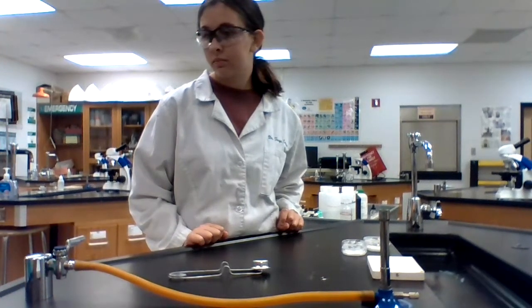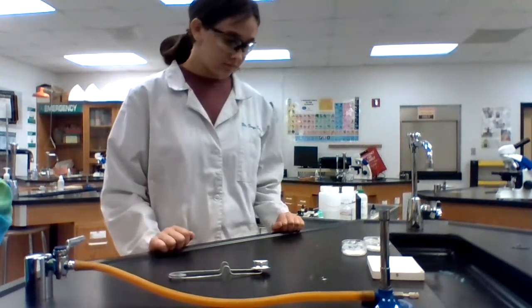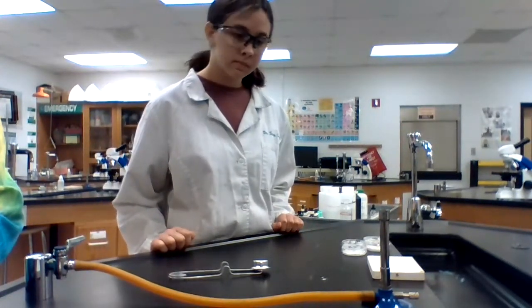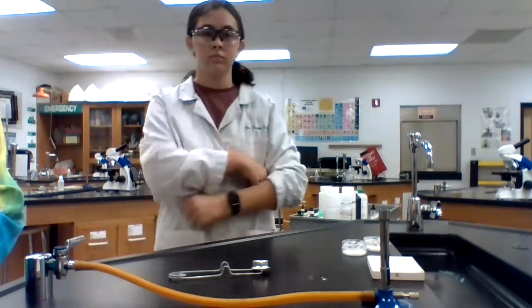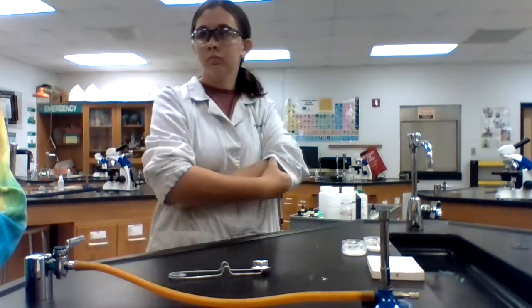All right, good afternoon. This is going to be Lab 9.5, and 9.5 is our flame test. The scenario is that a person went into a restaurant and there was some kind of a white powder on the table, and soon after the person became violently ill. And you are the investigators who have to try to figure out first, what is the white powder? And then second, could it have made the individual violently ill?